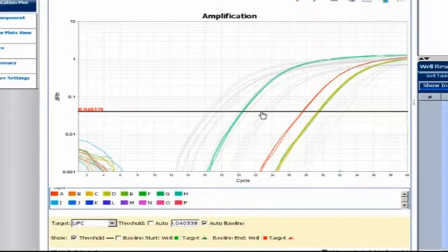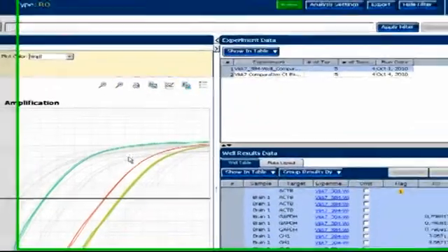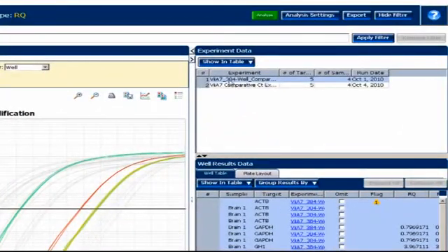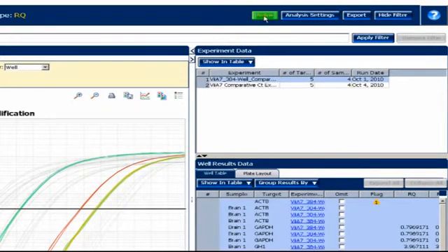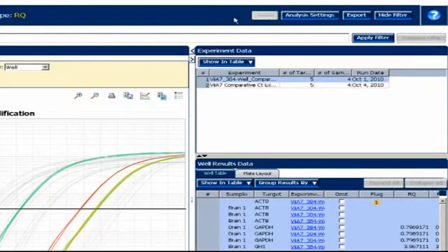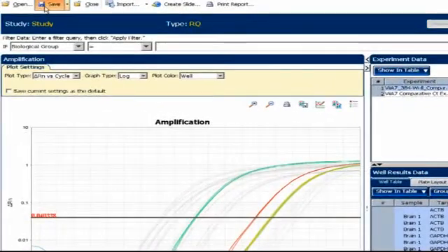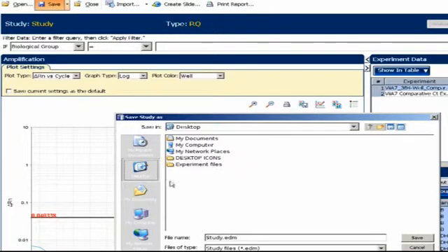Remember, any change you make to a threshold is applied to that assay across all plates in the study, exactly what we want. Be sure to hit the green Analysis button one last time before exporting. Also, you'll want to save the study before continuing, in case you need to go back and make changes later on.